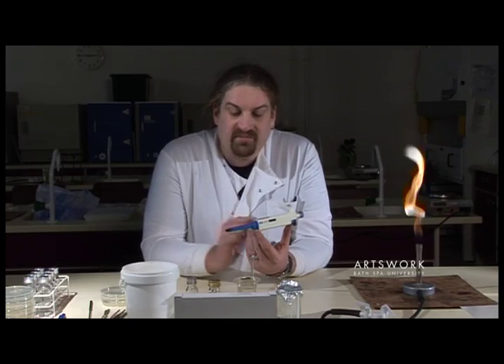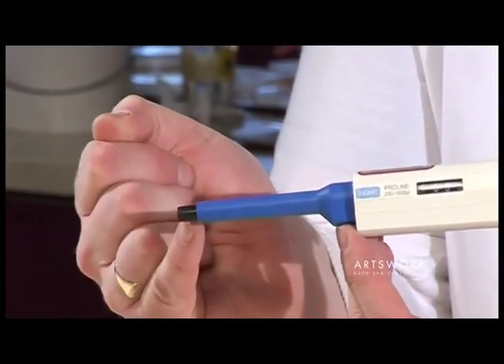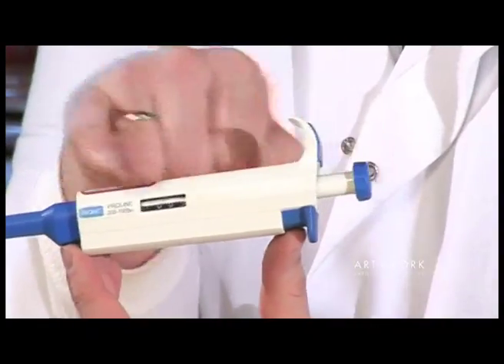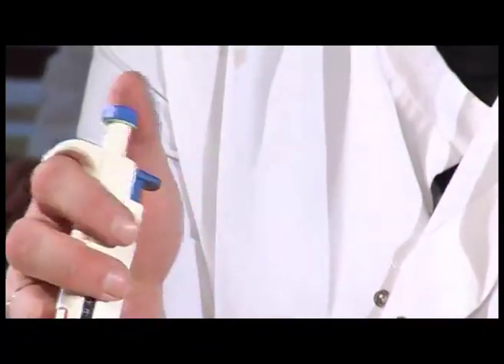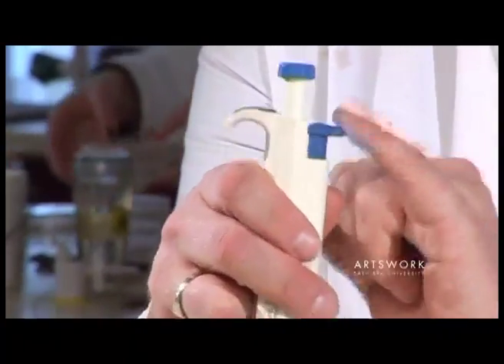So the pipette itself — you've got the end where your sterile tip goes, you've got the barrel, we have the main body of the pipette where we can set the volume that we're going to transfer, then you've got the plunger at the top which we use to pick up and dispense our sample, and the tip ejector towards the back.